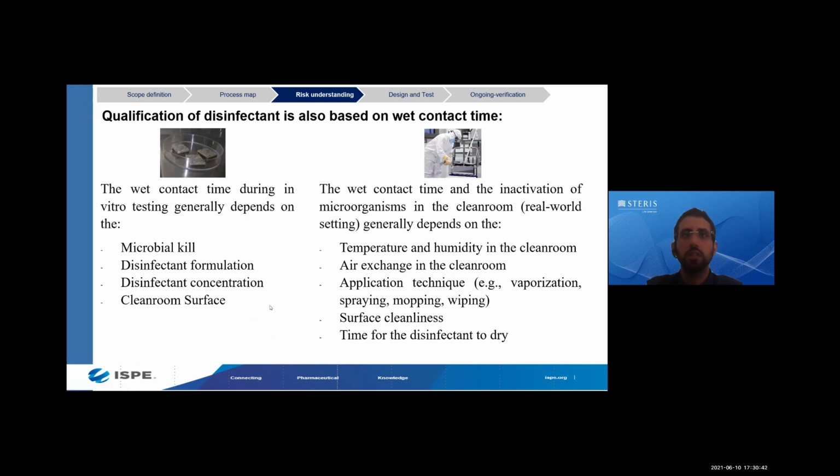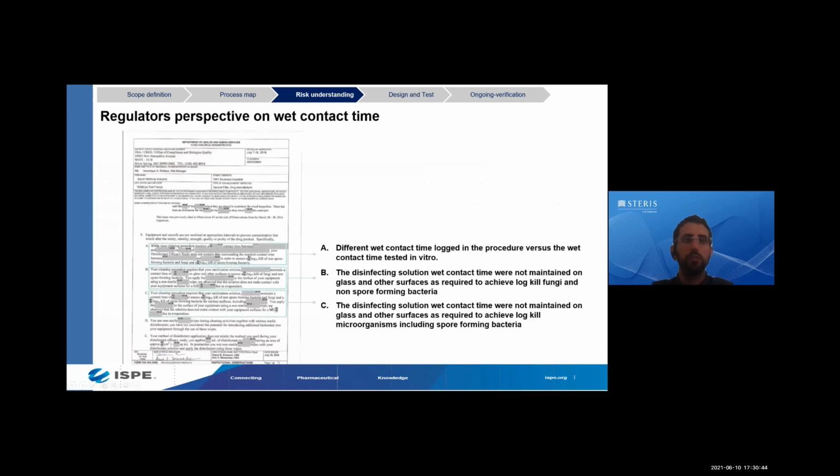Okay, we have seen a lot of 483s, and this is a recent 483 from 2016, within the recent 5 years, where it speaks about a manufacturer not respecting the wet contact time that has been validated in vitro versus what is being done in the facility.